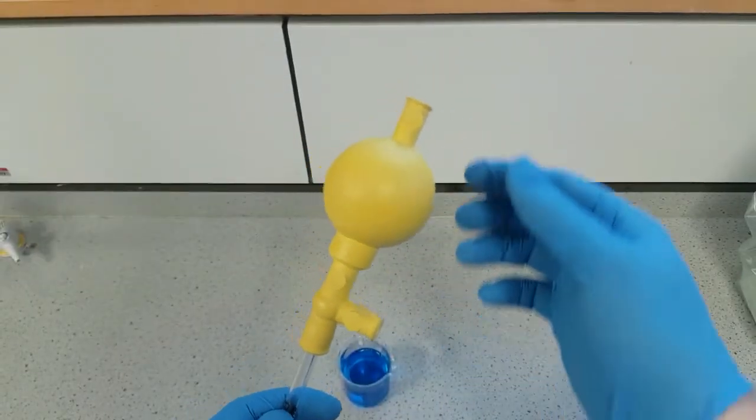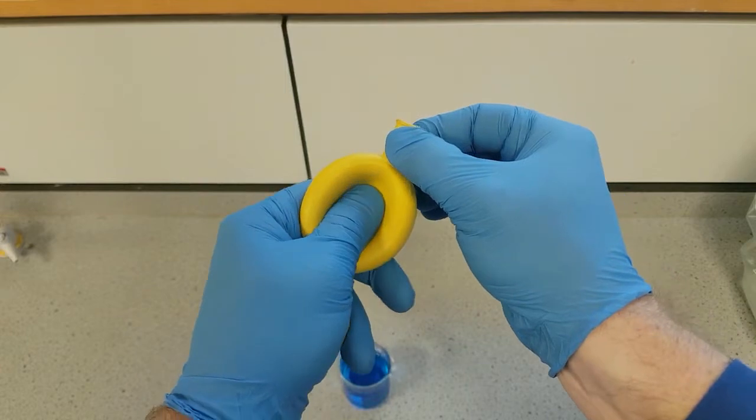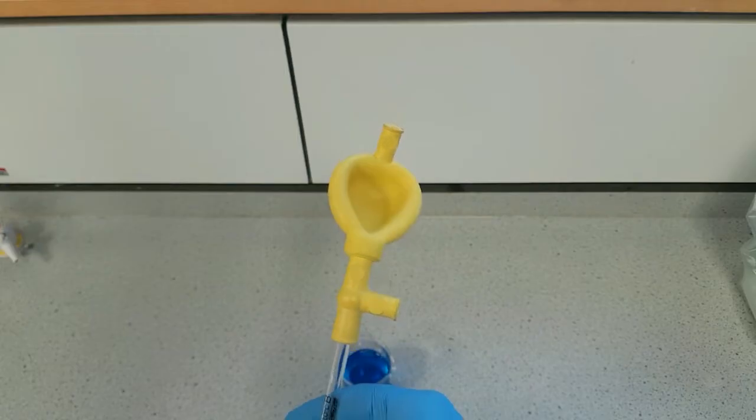To draw up liquid into our pipette, first of all we press the A valve and then press the bulb. Let go of the A valve and then let go of the bulb. That should let all the air out of the bulb.